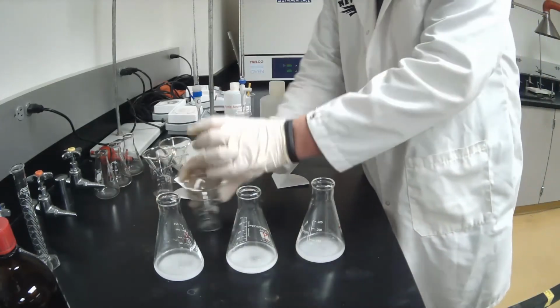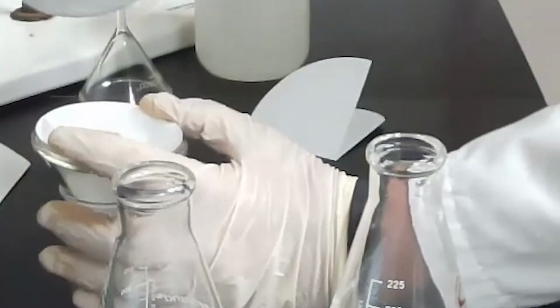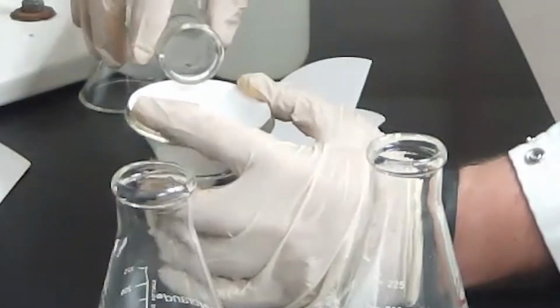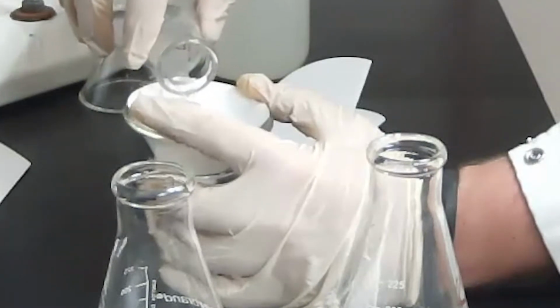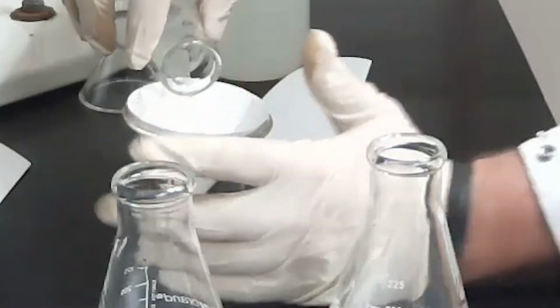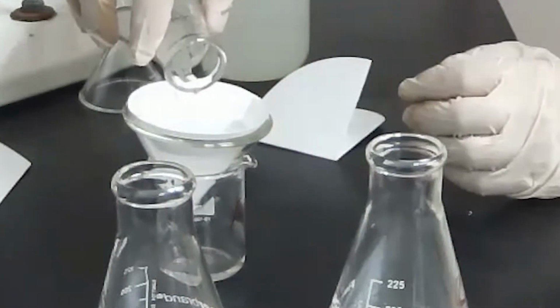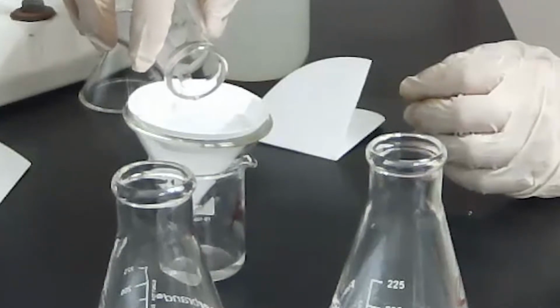So we're not going to wet this down because we don't want anything in there except for our residual unprecipitated silver nitrate. And you pour this in here gently, and we're going to capture as much of the precipitate as we possibly can, and then capture the filtrate at the bottom, which we will then be titrating to find out how much is left.